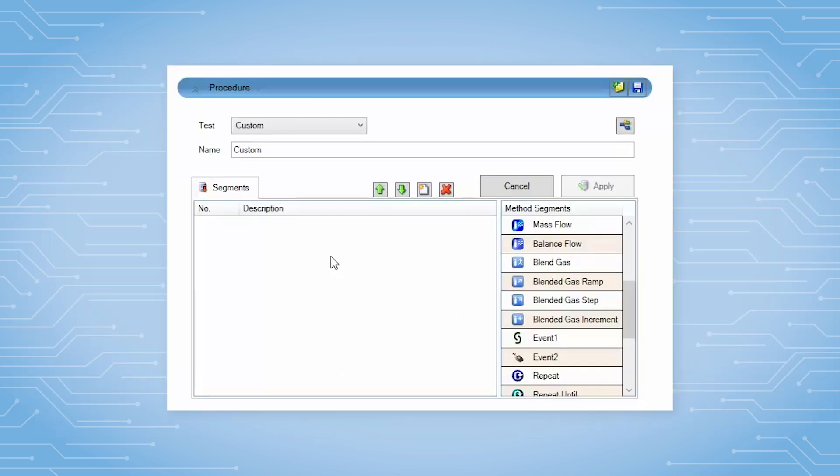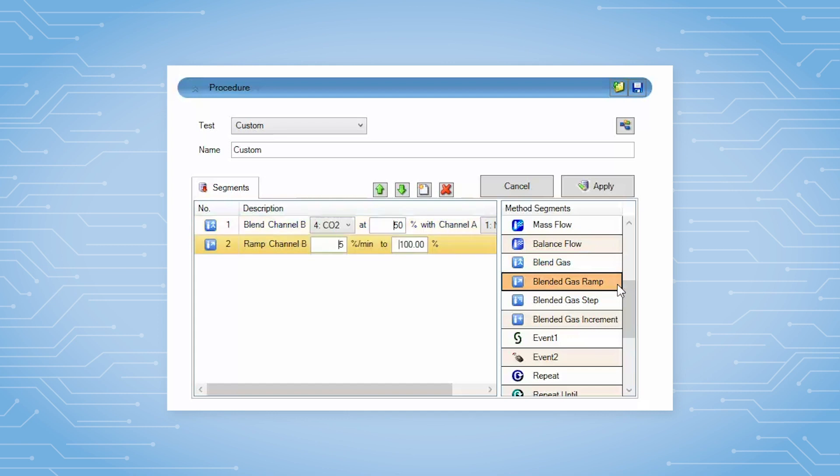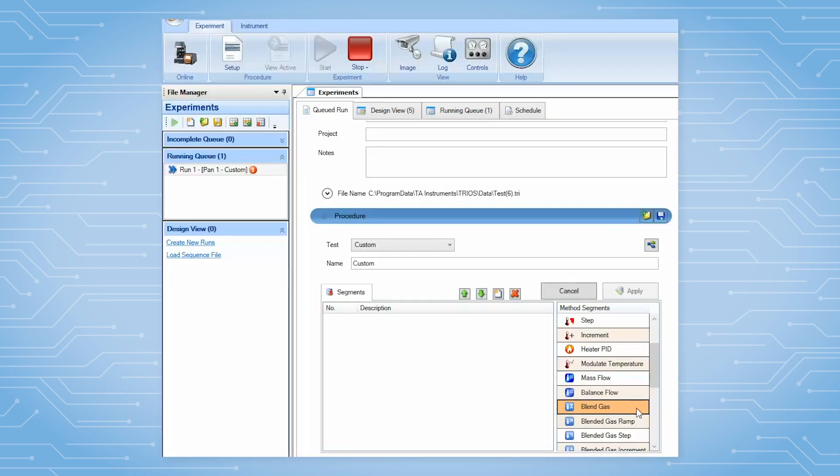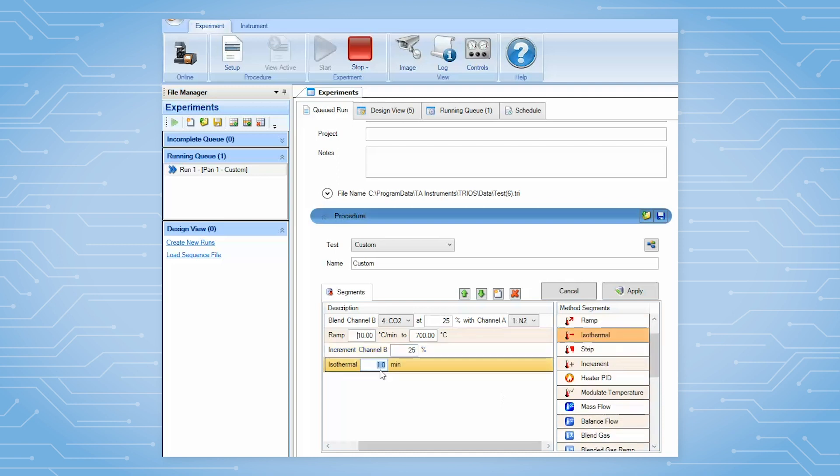TRIO software offers several method segments designed to be used exclusively with the Blending GDM, which includes Blending, Ramping, Increments, and Steps. When you select the Blend Gas Method segment, select the gas type and percentage of gas for each channel. Add any other segments for your experiment and click Start to run the test.